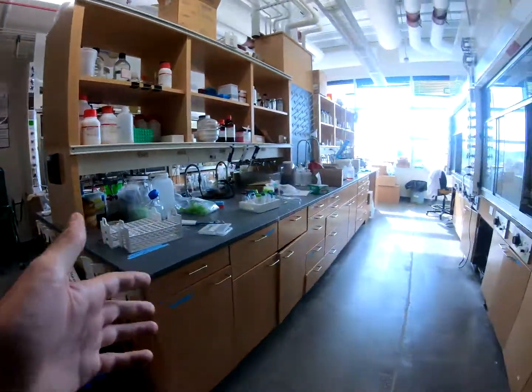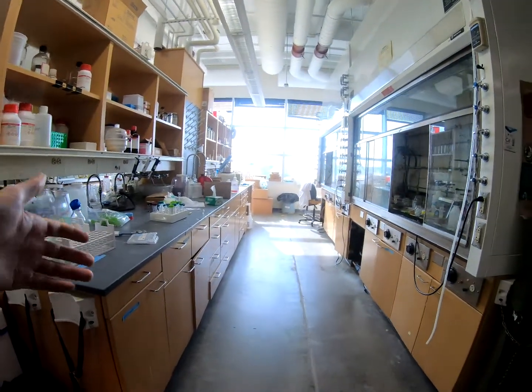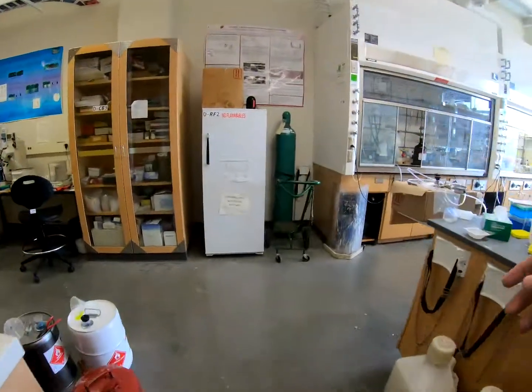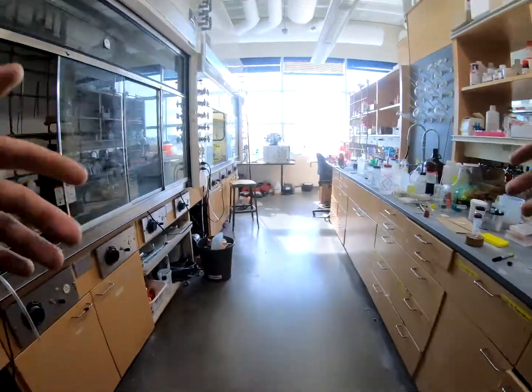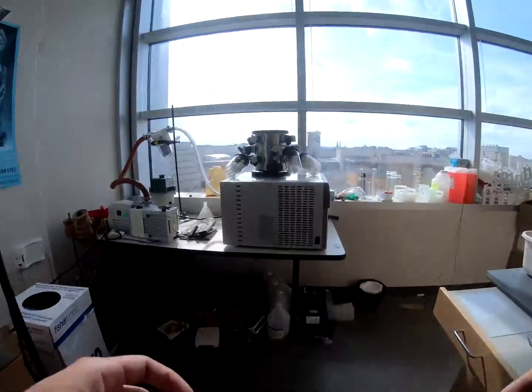Coming over to here, we've got the standard setup that I've been showing off in the other labs, which is the fume hood, cabinet space, and desk. Then in the next row, the same sort of setup that is typical of all of the Shane Tower lab modules. But at the end here is an instrument I'd like to point out, which is the LIO.